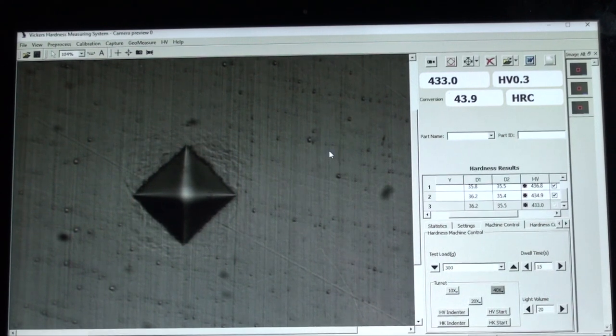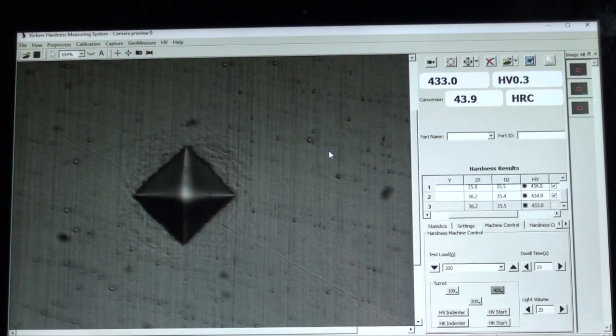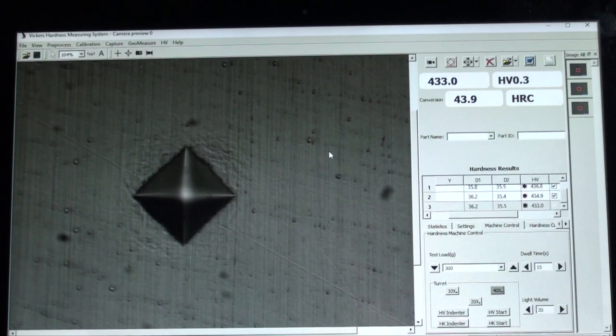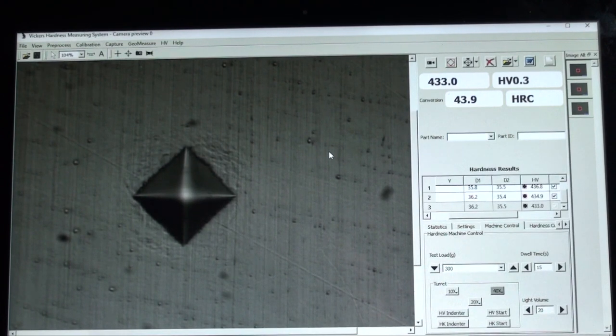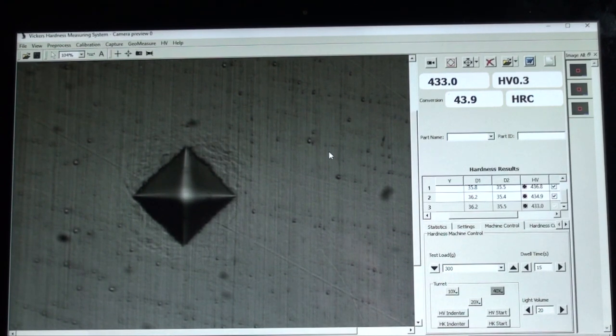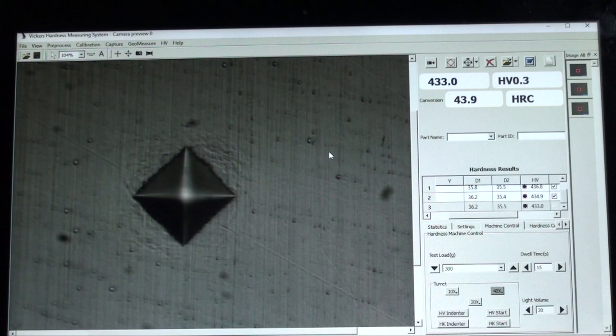Once your test is completed, you can move the position of the digital stage micrometer to find another position to take another test.